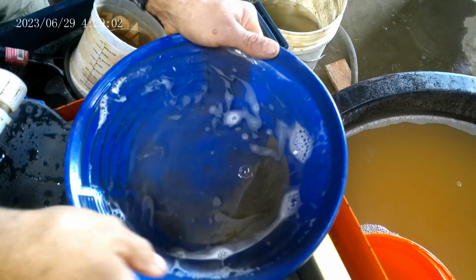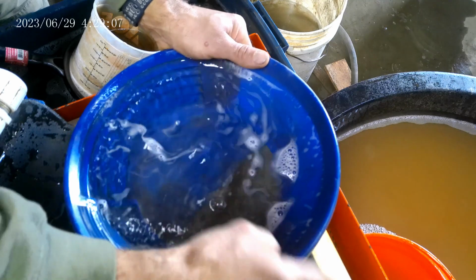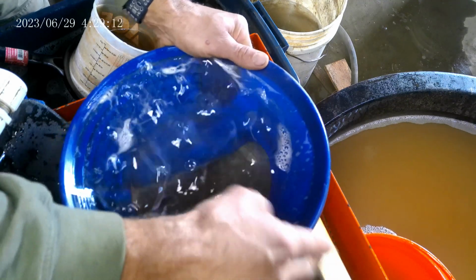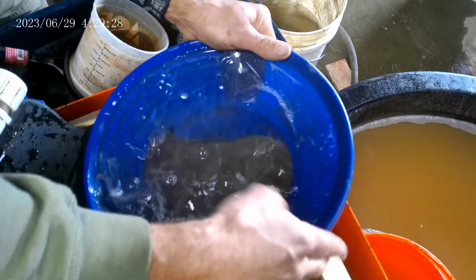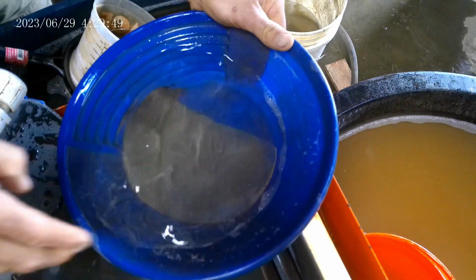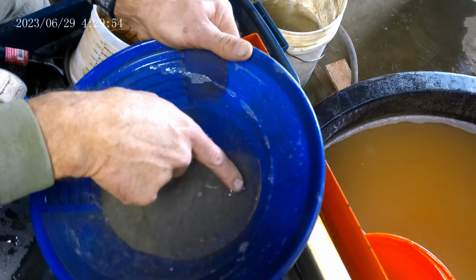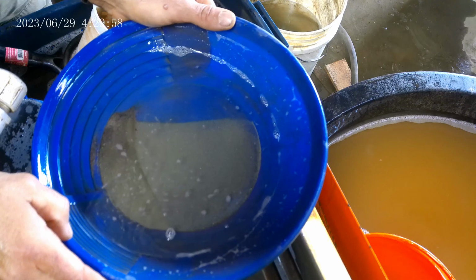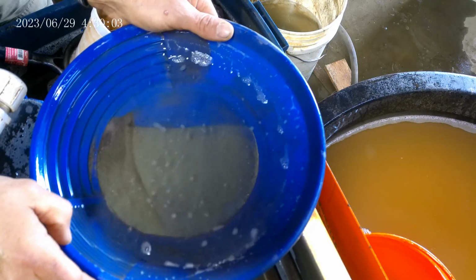Okay, so here's number 1 concentrates. We'll see how much free gold we got in it. All right, well, that's definitely not all of it, but you can see that line there. So we're going to get this roasted and pre-treat it with some sulfuric acid. See if that makes a difference.